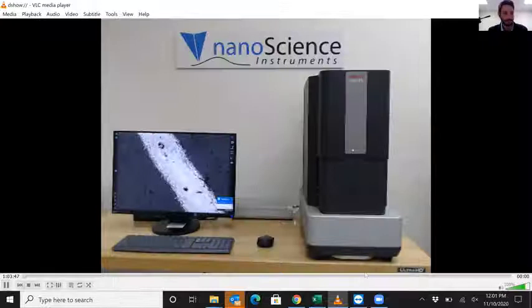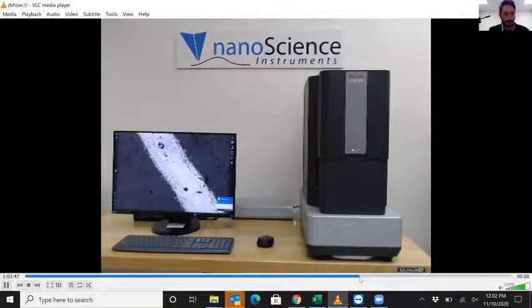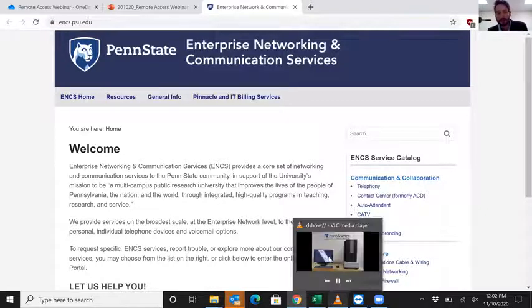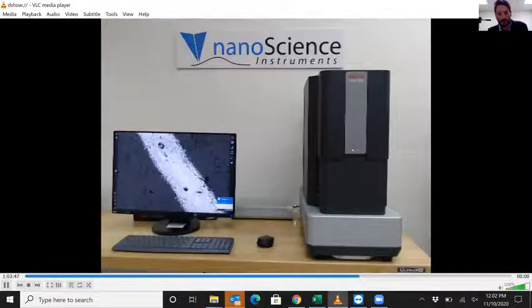What torr level does it pump down to? Yeah, we're working at the 10^-7 range at the source, and then at the imaging environment, we're typically at about 1 Pascal. So trying to get this camera to work. Maybe it won't work, but yeah. So 60 pascals in the imaging environment to about 1 Pascal for a high vacuum mode is the rough vacuum levels.